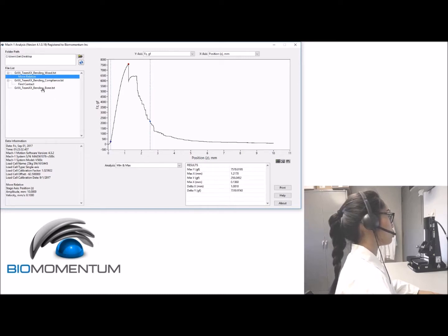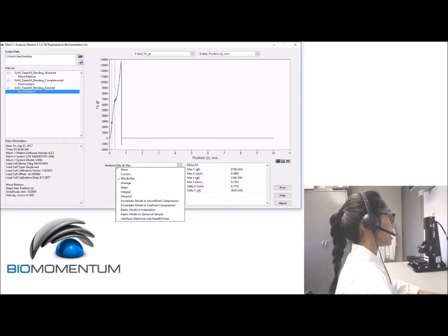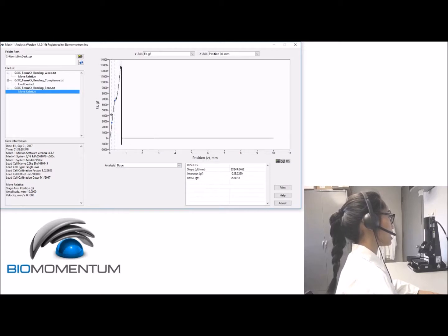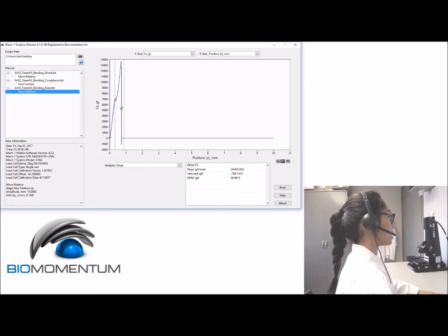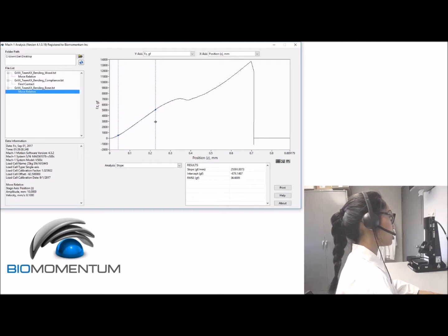Now we will do the same analysis for the bending test of the bone — the rat femur. Select 'Move Relative,' and using the slope analysis, select the linear region of the curve. You can zoom in to help get a better view of the load-displacement curve.